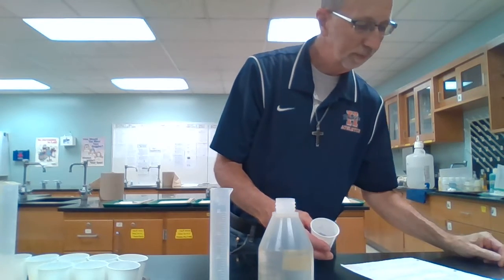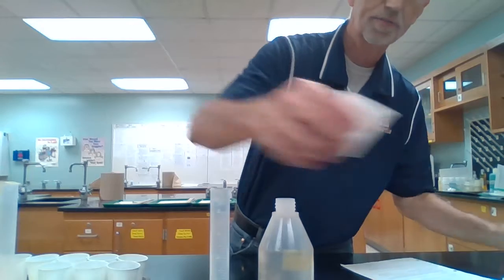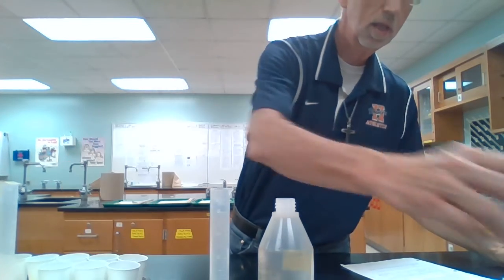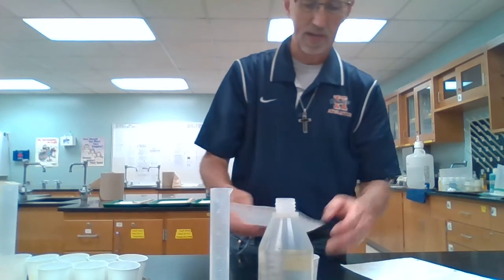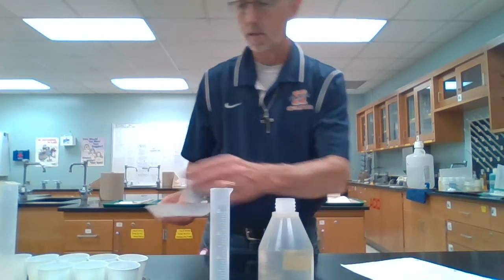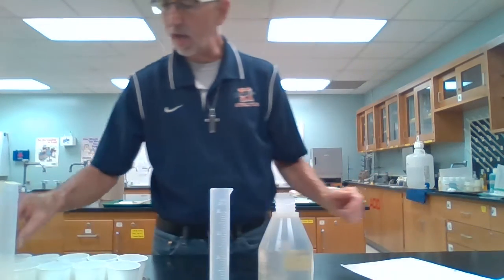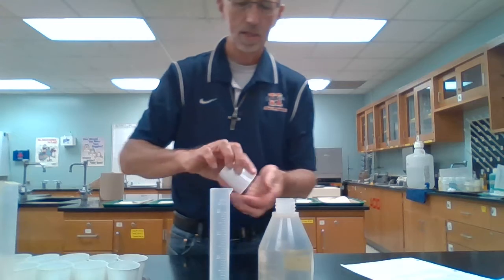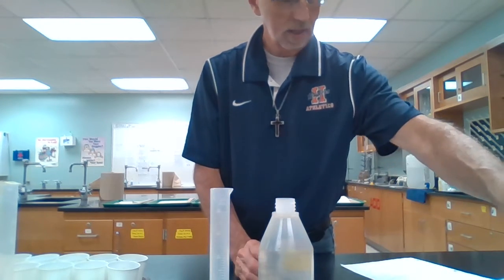Number 4, we've got, again, these oddball shaped pieces. Again, I don't know if you can see them. There they are. And there's that. 39.16 grams for that sample. And zinc number 5, back to these oddball shaped little bar looking things.